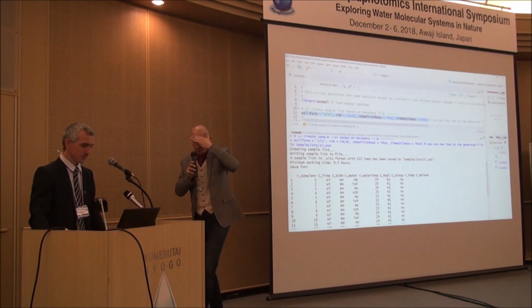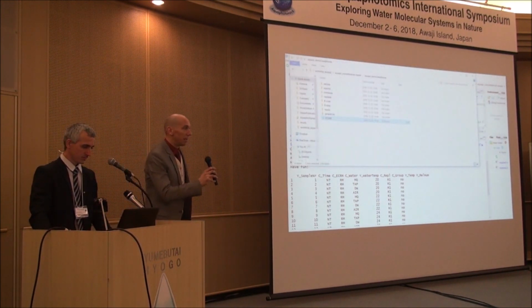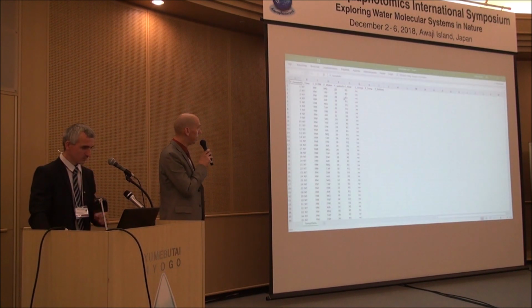Now, if you go in your Explorer or in your Finder, depending on the machine, you go into the sample list folder of your course material. You go to SL out. You will find suddenly a new, freshly appeared Excel file. If you open that, you will see, wow.